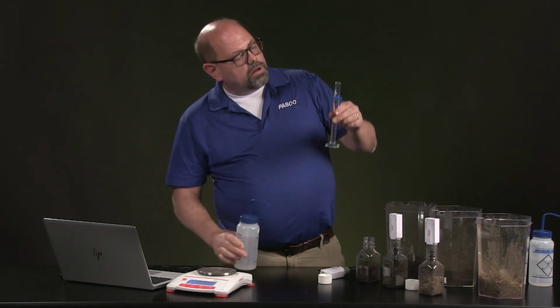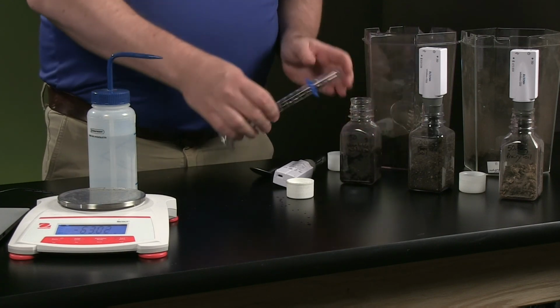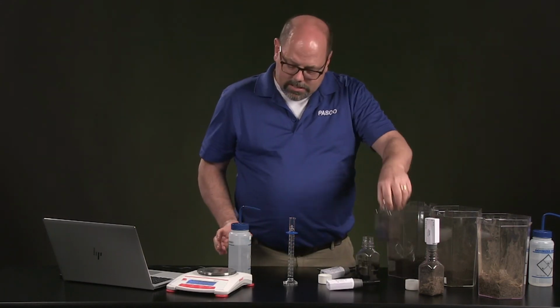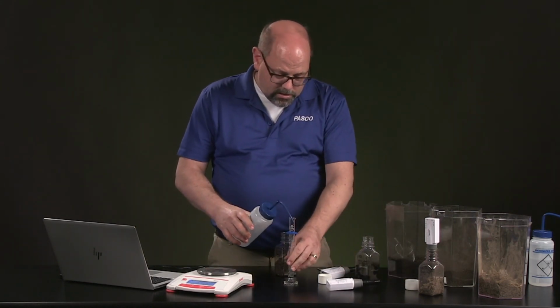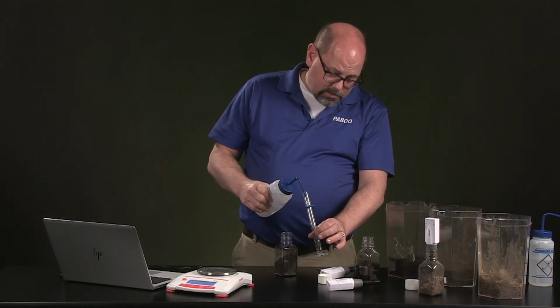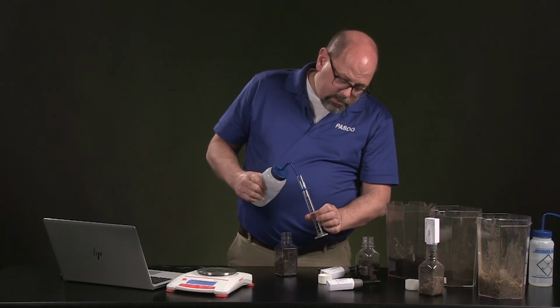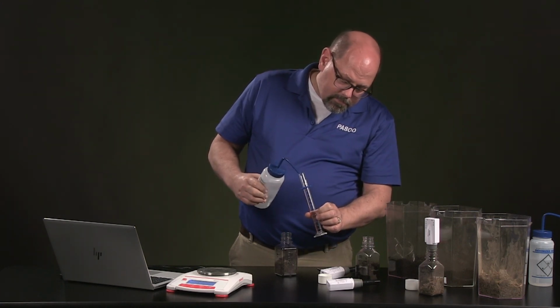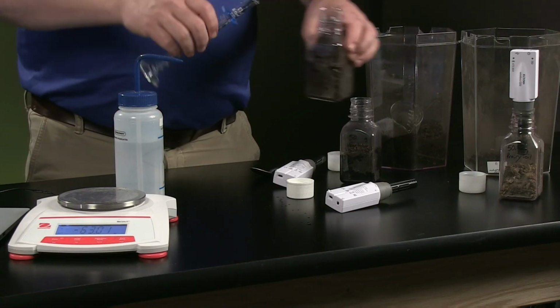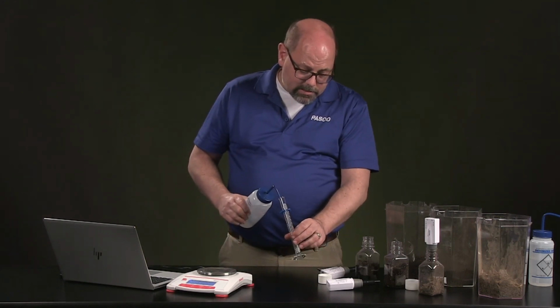We just want to make sure that we're each consistent. And we'll take this one out. That'll be good because that'll air out the carbon dioxide that's inside the sensor itself. Here, we'll go ahead and give that a good squeeze. Water's filling up pretty fast. We'll go up to 25 mils. Okay, there's the forest soil. And one last time for the prairie grasses.